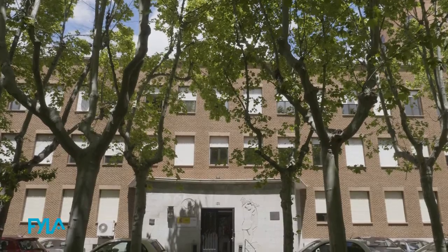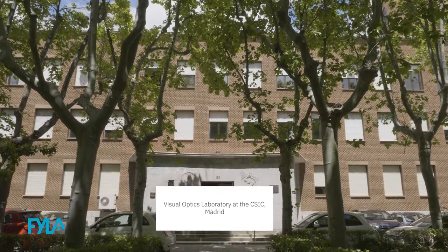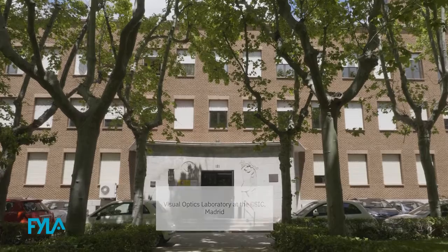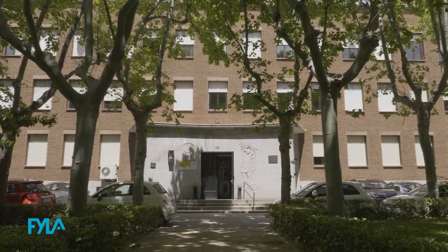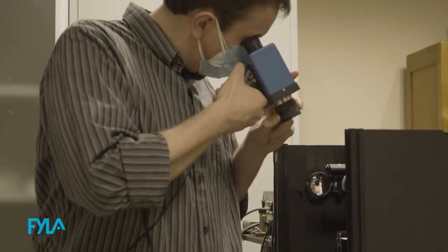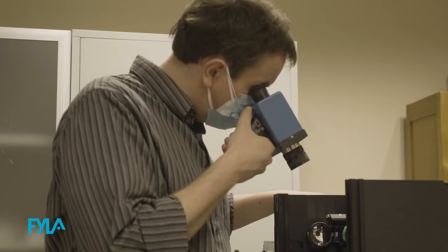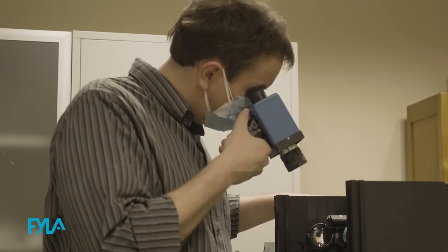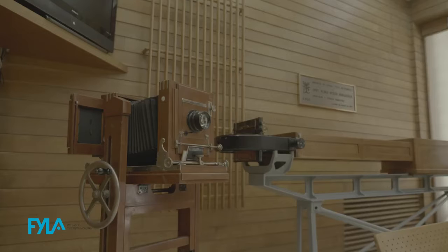The VOBio, the Visual Optics and Biophotonics Laboratory at the CSIC in Madrid, led by renowned Professor Susana Marcos, is a world-leading research group for the study of non-invasive in vivo imaging techniques, including SHG microscopy of the eye. We've established a collaboration with Dr. James Germann, an expert scientist in SHG microscopy, and we visited him at the CSIC in Madrid.